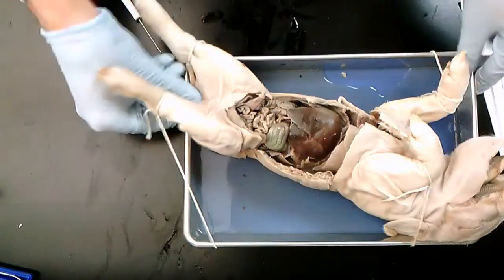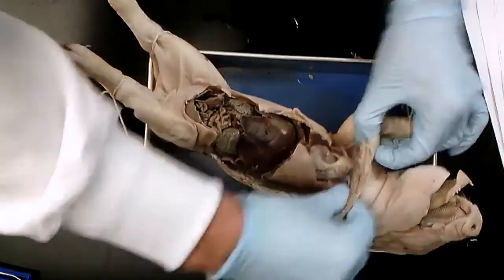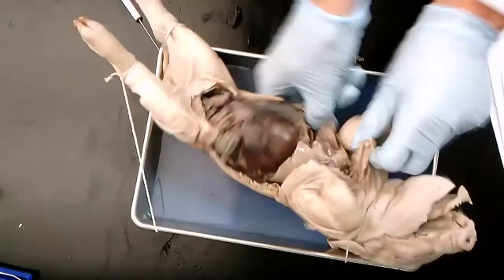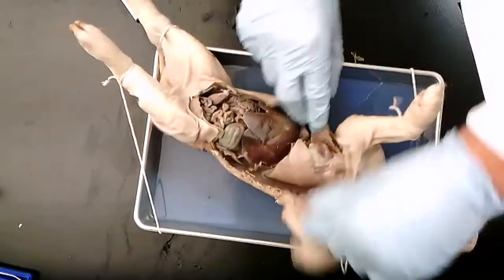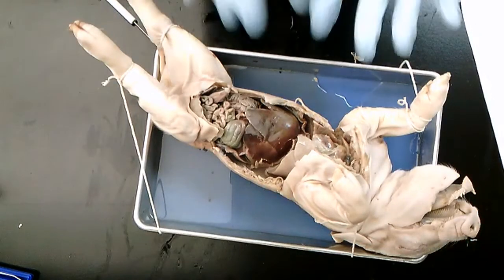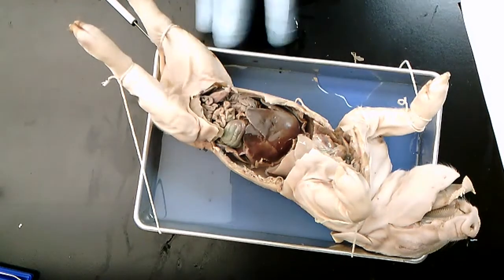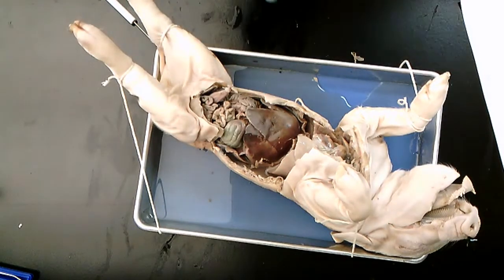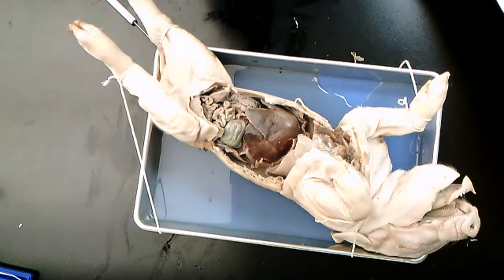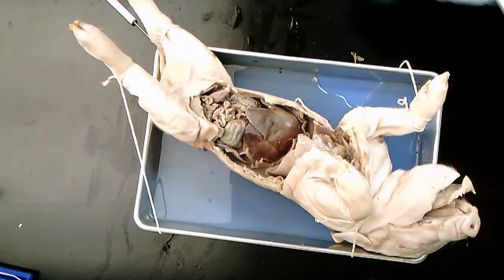All right. So now, for the most part, we've exposed the organs. So now your students, my suggestion would be first to have your students identify the organs when they're inside the cavity before they start to take them out, because I think if this is their first time doing it, it's going to be a little easier to learn what they are when they're in the cavity.